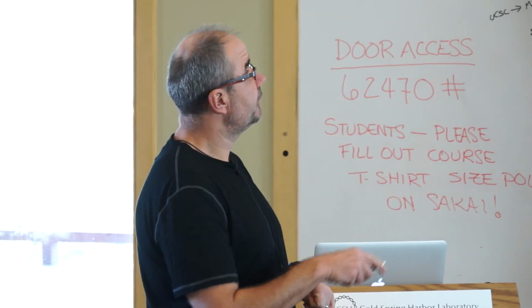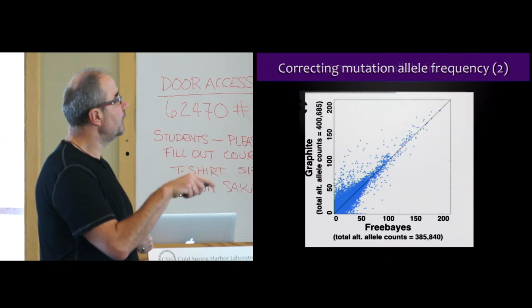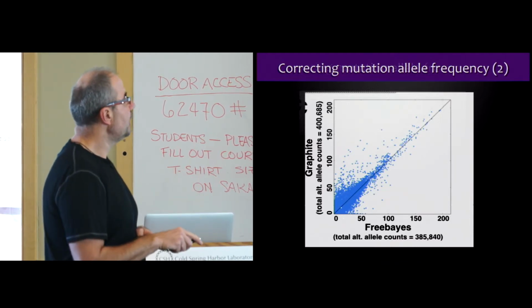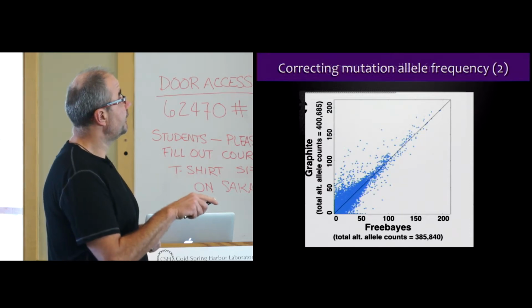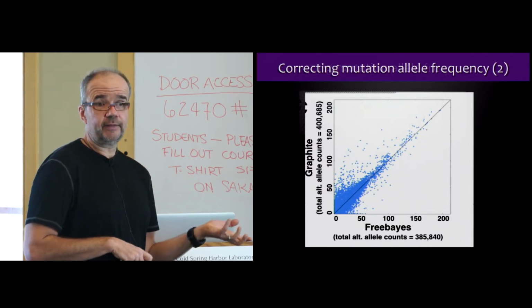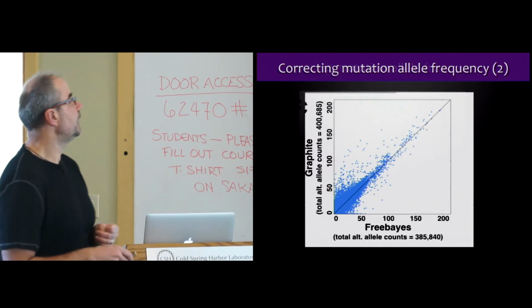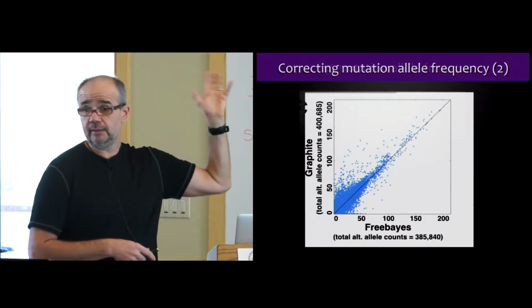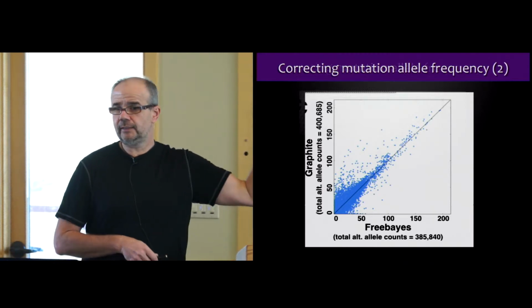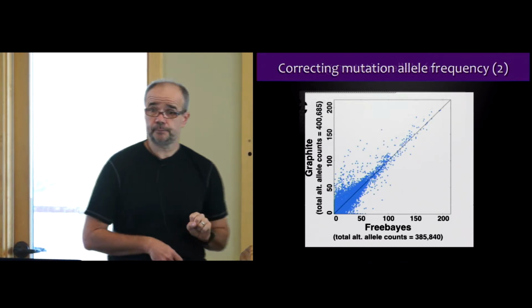And this is sort of like a dot plot. You can see that in many cases there were no differences, but there are many mutation sites where the allele frequency from the original call gets doubled or tripled. And if that happens to be an important mutation, you want to know that. You can see there's definitely a shift to higher allele frequency of the somatic allele with this method, because you're really able to fish out all the reads that were important there.